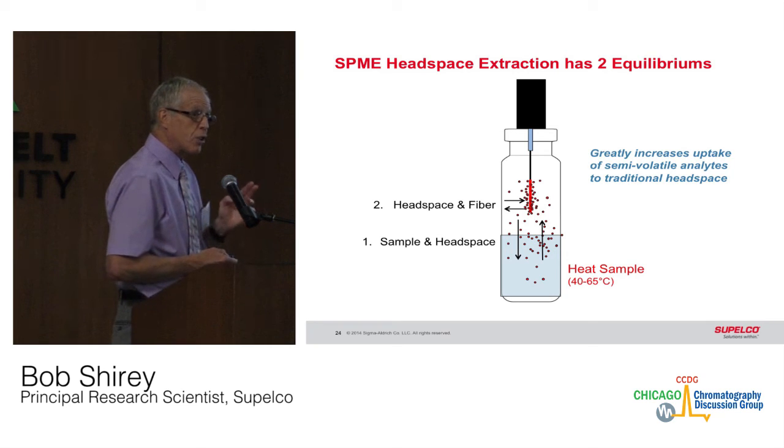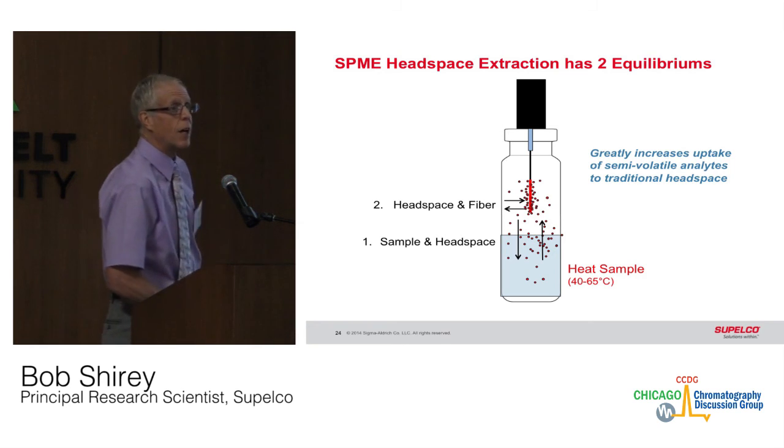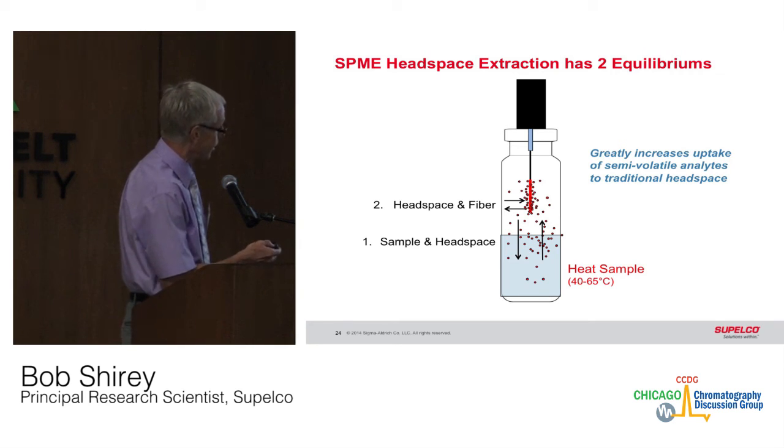SPME headspace extraction has two equilibriums. You have an equilibrium between the sample and the headspace, and an equilibrium between the headspace and the fiber. So as analytes go into the fiber, more come up out of the sample into the headspace. And if you're using particularly a thick fiber coating or an absorbent type fiber, you can get a pumping effect so that you get a lot of concentration of analytes onto the fiber. It's much better for semi-volatiles than traditional headspace because of this effect. And the nice thing is you don't have to heat your sample real hot. 40 to 65 degrees is usually adequate.